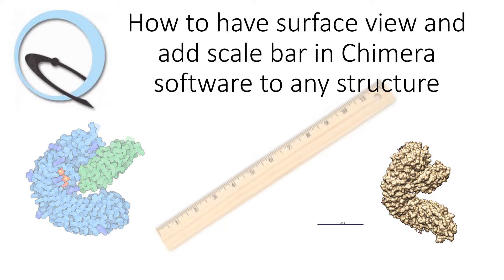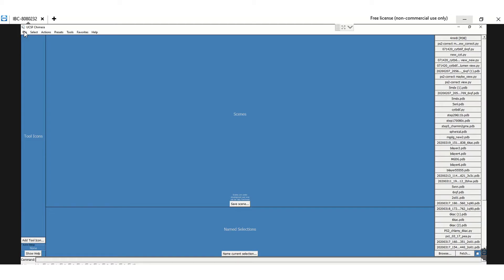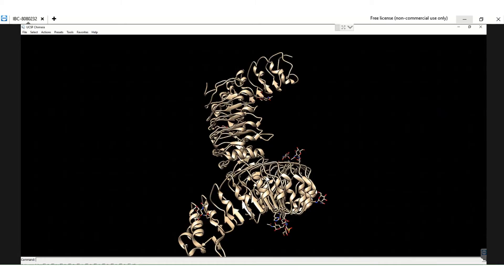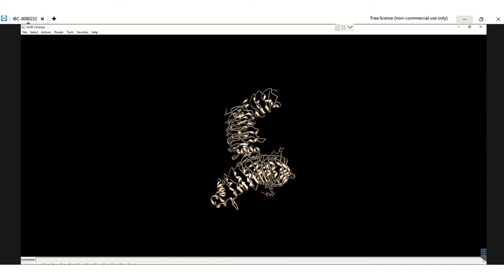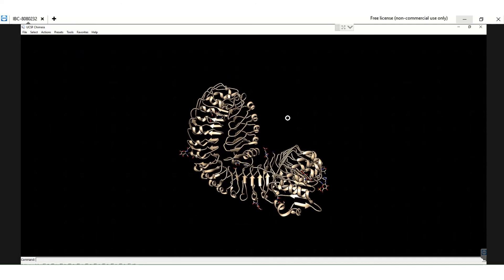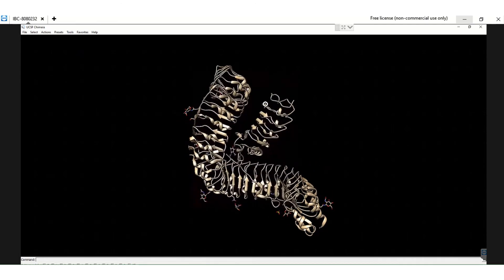This software is free and you can download it easily. Once you have the UCSF Chimera software downloaded, open the software. Then go to File, Fetch by PDB number, and enter the PDB ID of your interest. Once you put in the PDB ID you get the protein structure, and you can move it around to find the best view.